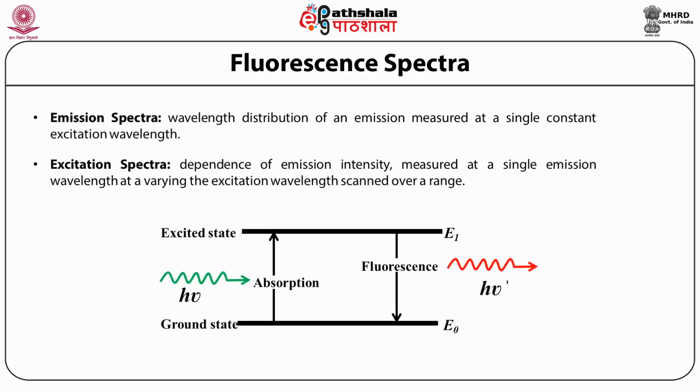Let us discuss the fluorescence spectra. When light is incident on a fluorescent material, it excites electrons to a higher energy level.